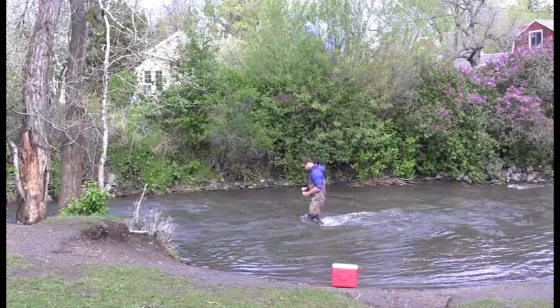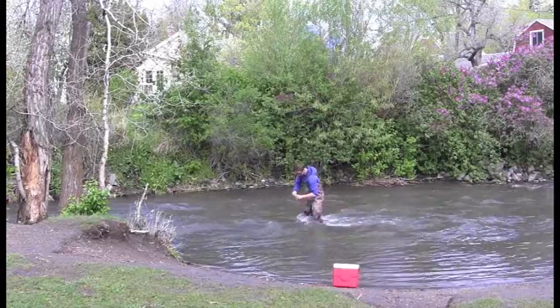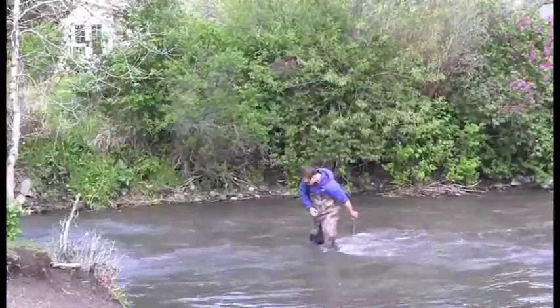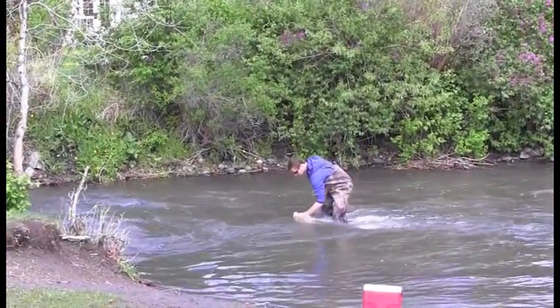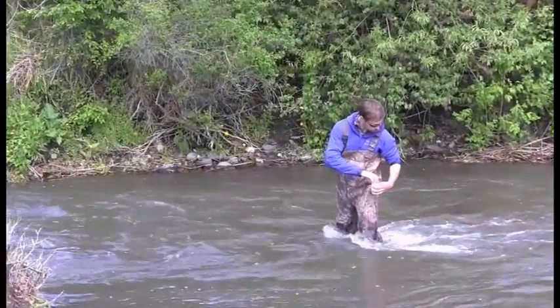Before collecting the sample, you will need to triple rinse each bottle. While facing upstream, uncap the bottle and fill it part way with water. Loosely recap and shake. Dispose of the rinsed water downstream behind you. Repeat this process twice more.